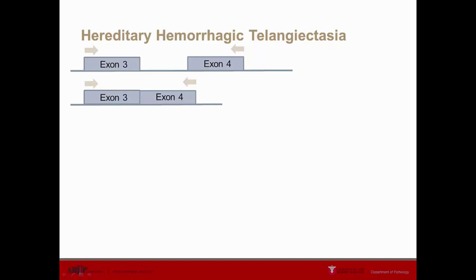For the qPCR, the primer sets were designed with one probe in the exon and one probe in the intron. Only going to interrogate the real gene, not the processed pseudogene. So the only way we could have come to this conclusion was by using an array which gave us information on the intronic level to compare with the exonic variation that we're seeing.